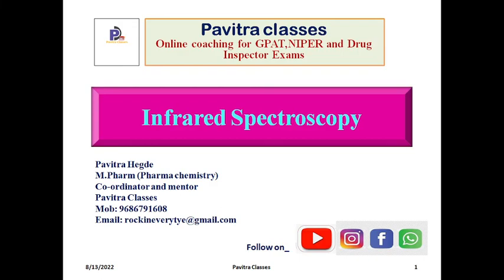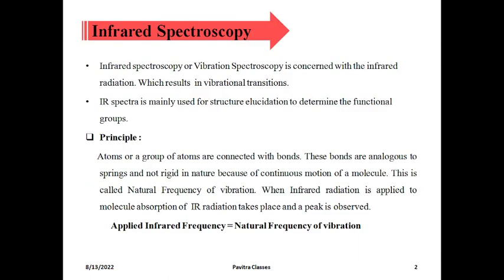Next topic in pharmaceutical analysis is infrared spectroscopy, IR. It is very important in pharmaceutical analysis. IR, NMR and mass are very important topics in pharmaceutical analysis. So we will study what is IR, how it is interpreted, what the instrumentation part of the IR is, and what the principle of the IR is today.